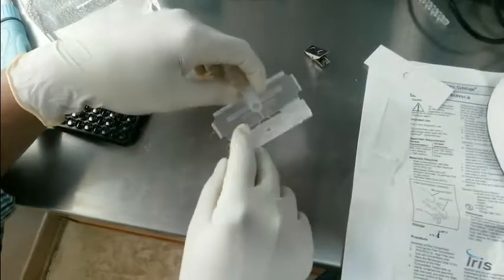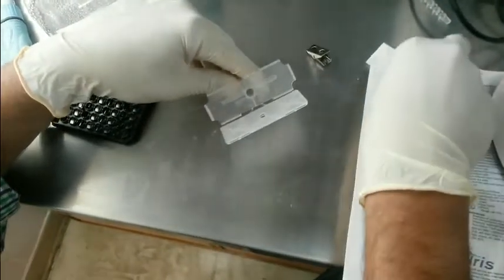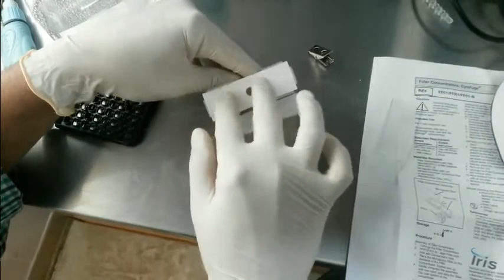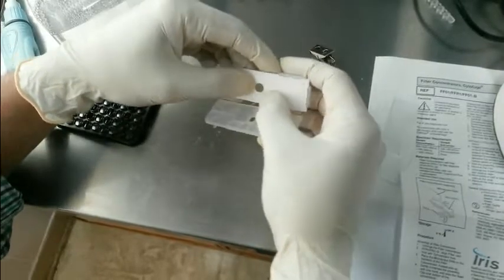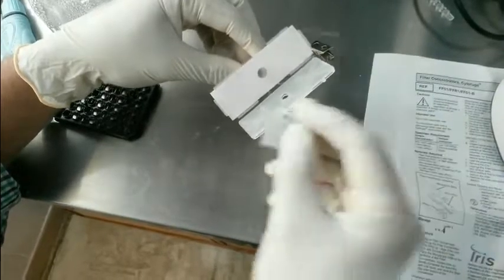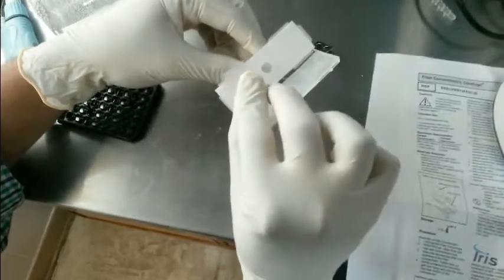So first of all we take the filter concentrator and we fix the filter paper in it just like this, and after that we need to insert our glass slide.